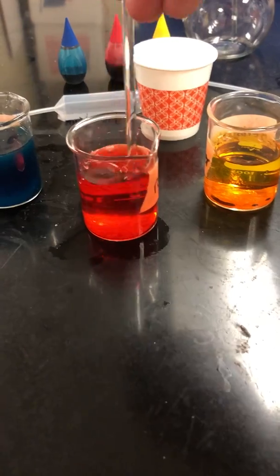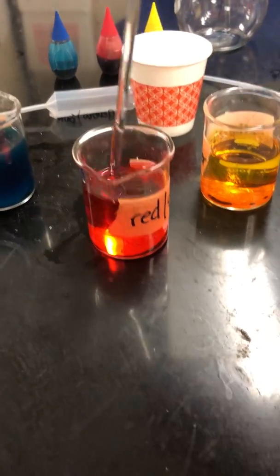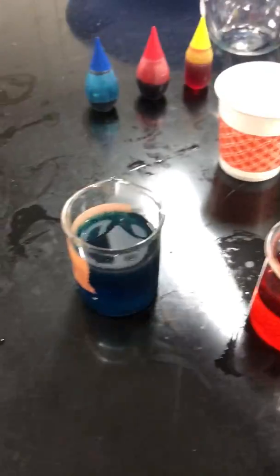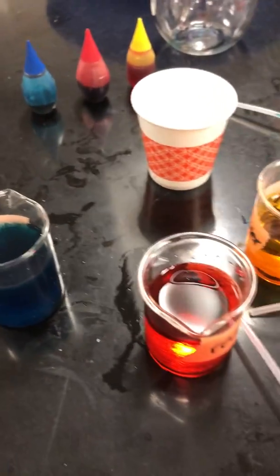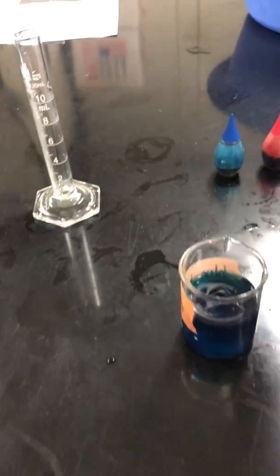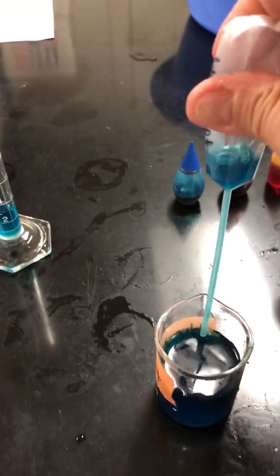Now, normally I'd be holding the speaker, of course, but holding it, you could stir even more. Okay. Nice. And then the instructions say, okay, make sure you read, Michelle. Okay, there we go. Yeah, blue. We're going to put approximately 3 milliliters of salt water on the bottom. Beautiful.